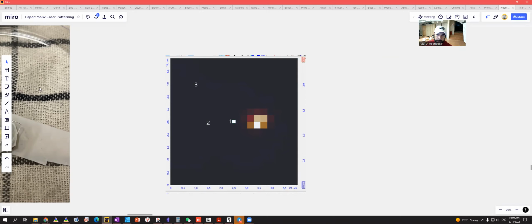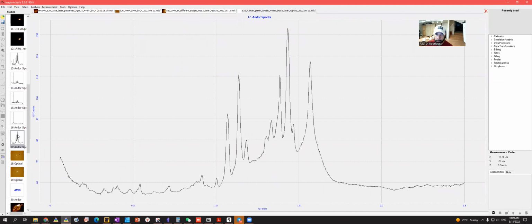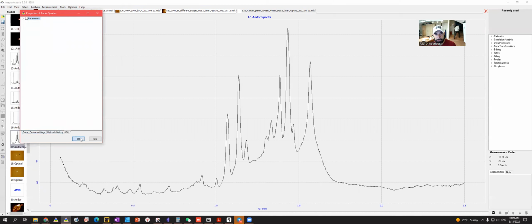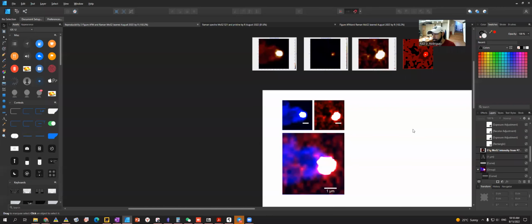This one is okay, and this one was in the middle. But I don't know where the other ones were. I could guess where they were and compare with the hyperspectral map, and also by intensity. I can't remember why we have 3. I have these 3, but they don't match the pictures. Anyway, we already finished this part.